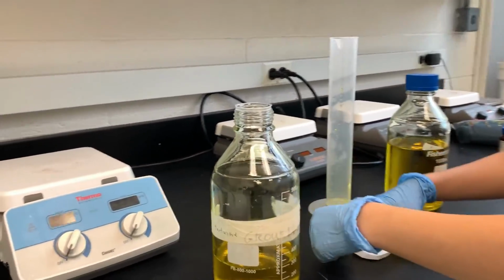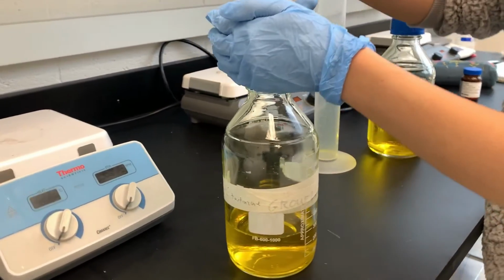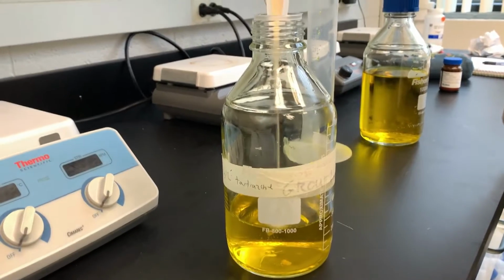The sodium alginate is added into the solution and stirred vigorously until a smooth, uniform solution is formed.